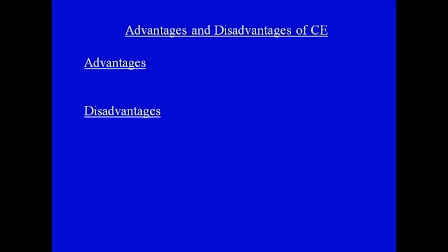There are a lot of disadvantages also. It cannot be preparative, so you cannot do very large scale preparations or separations. Low concentrations and large volumes are very difficult to handle. Then there are problems with sticky compounds, for example certain proteins might stick to the negative charges, and there could be streaking of the protein so you will not get a sharp peak. Some species are hard to dissolve. Reproducibility is another problem; it is hard to get reproducible results many times. These are certain disadvantages, but there are many advantages to using capillary electrophoresis.